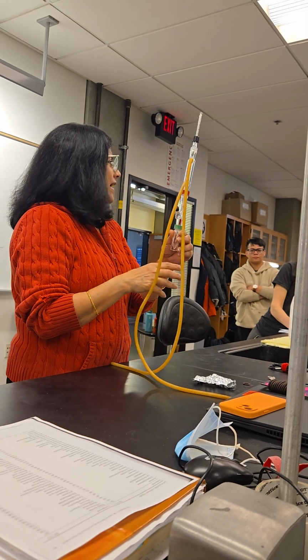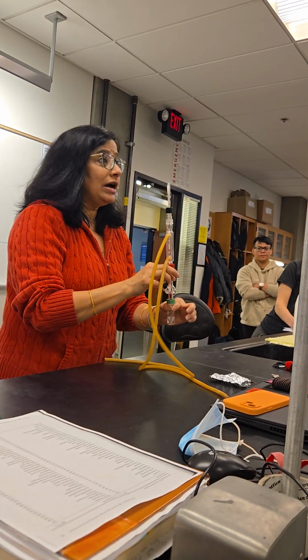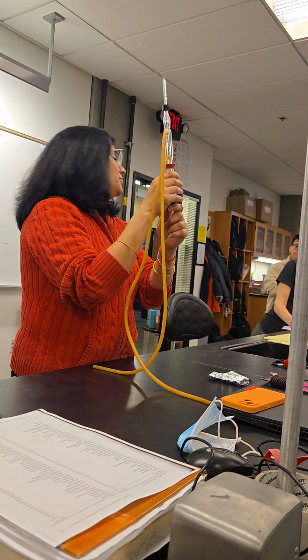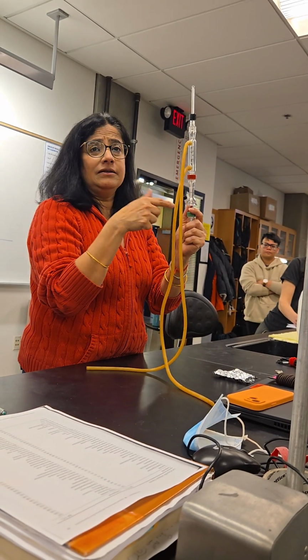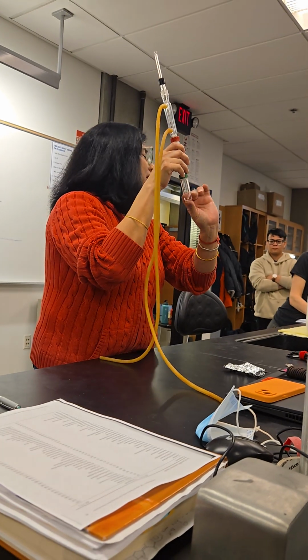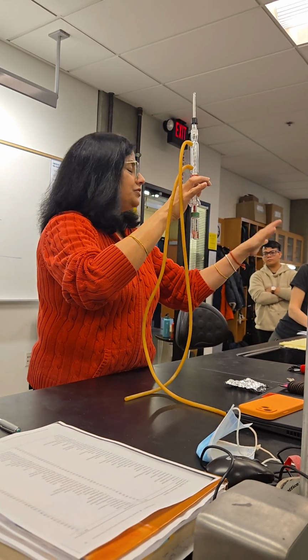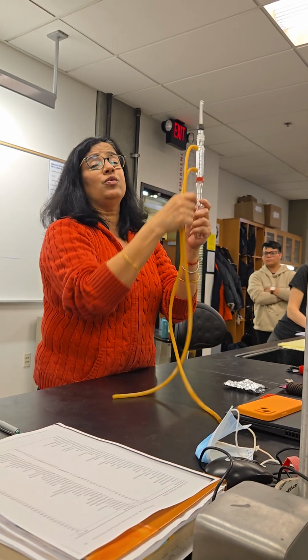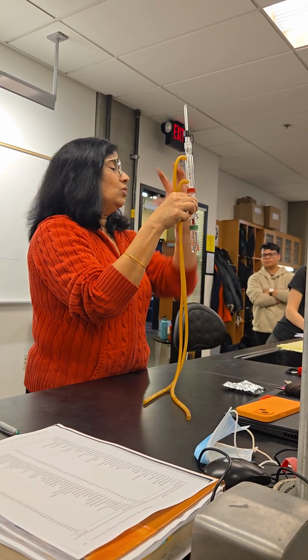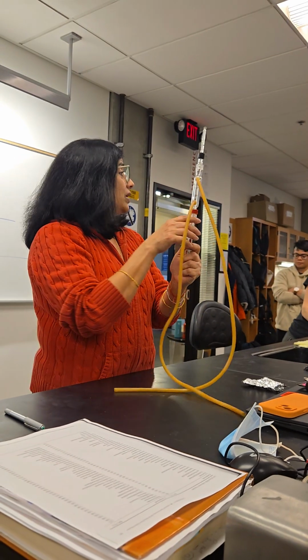But what happens to sand? Does sand become cool right away? No. So you have to actually take it out of sand. Otherwise, sand is still heating it. Make sense, everybody? So when you have a few drops left behind, pull this out of the sand so it starts cooling, and then turn off your heat. And don't turn off the water though till everything is cold. Does that sound okay with distillation?